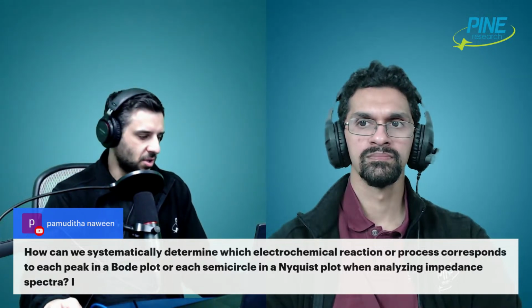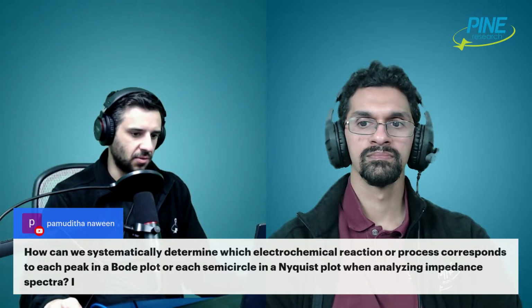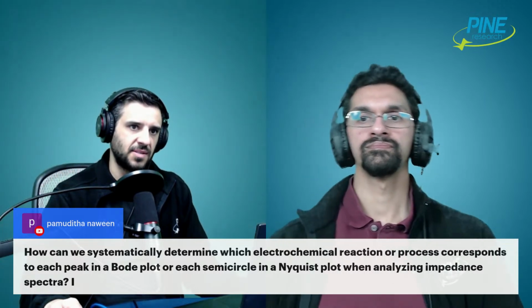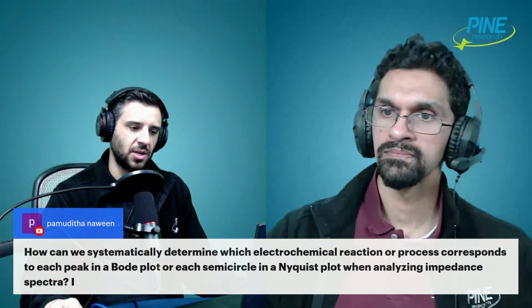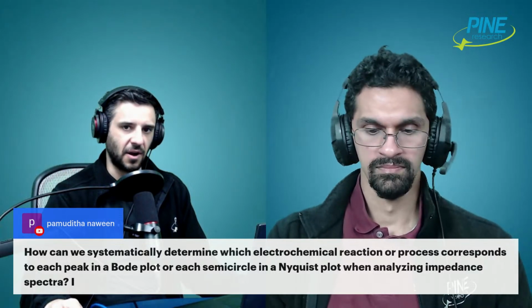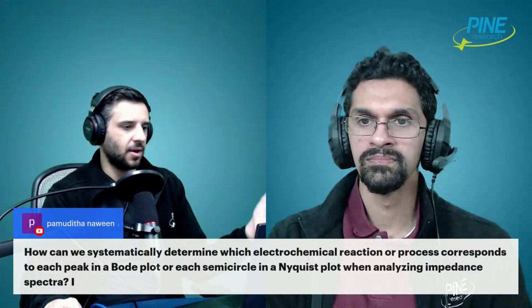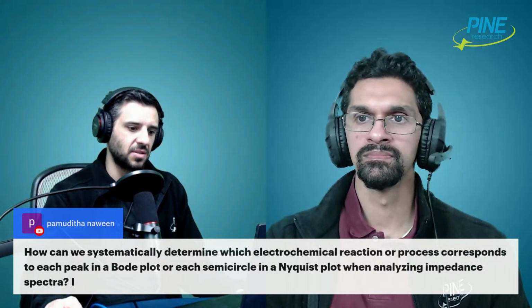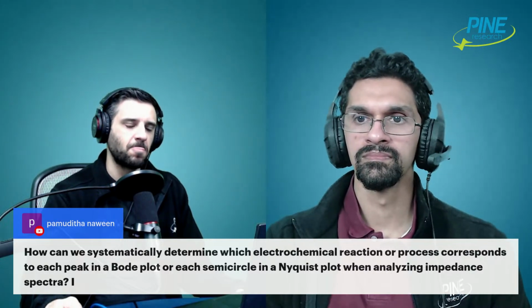So there are some things you can draw conclusions about, but as a general rule, it's not like 17 kilohertz to 112 hertz is exactly always where the Faradaic reaction of interest occurs. That's just not how it works precisely. It's not always that easy. You do need to have some other auxiliary information about your system.